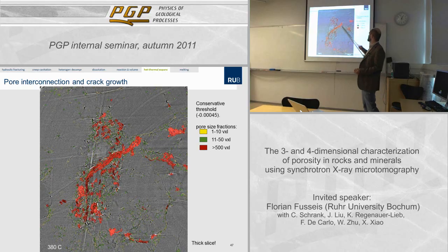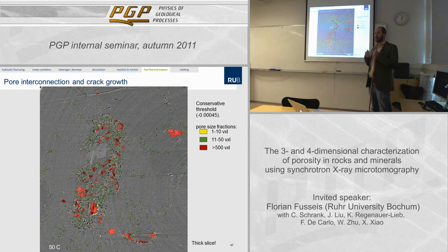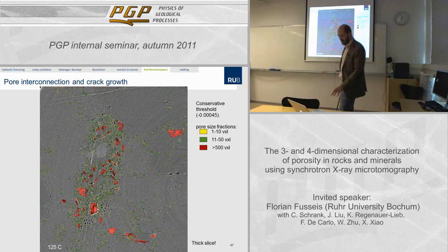What we plan to use this for somewhere in the far future is to do kind of in situ crack propagation studies, to learn more about fracture mechanics on the granular scale, because we know many of the boundary conditions that are going on, and I'll come to that right now.